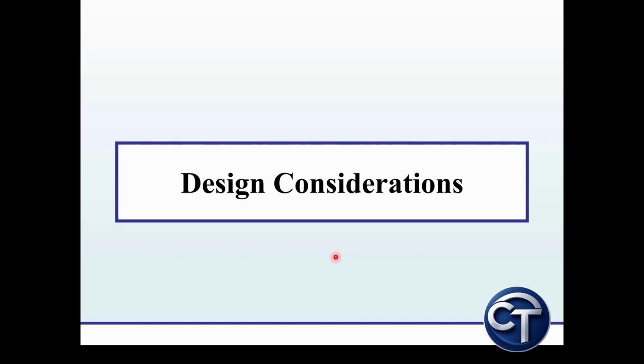Do you know the importance of primer design? Let's understand why primer design is so important. A well designed primer ensures high specificity, binding only to the target sequence, high efficiency, enabling proper amplification, and high reproducibility, giving consistent results.